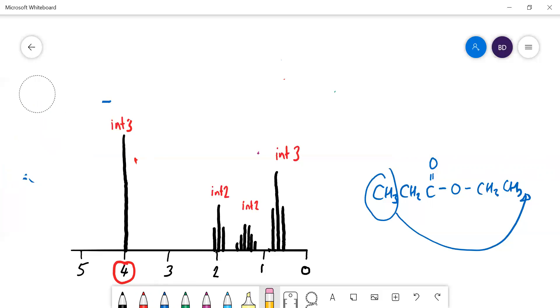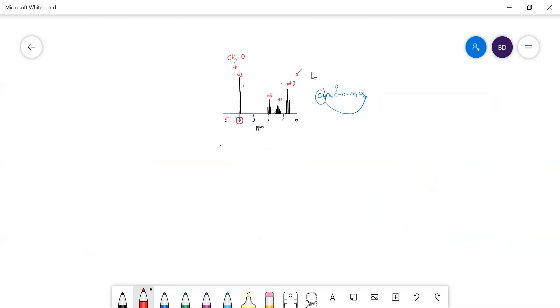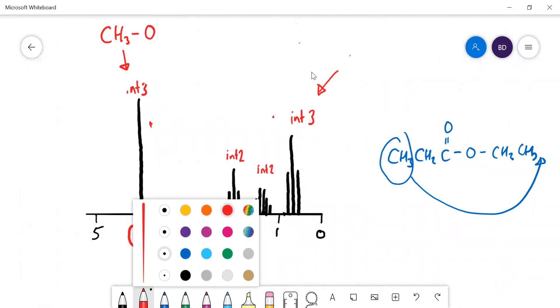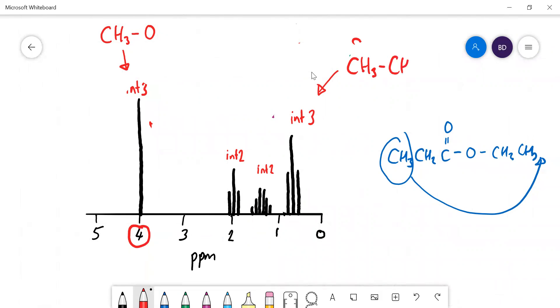So we have got CH3O, that's what that one is. Let's have a think about this one here. It's a CH3 because it's got an integrated value of three, and it's got a splitting, it's a triplet. So that is probably a CH3 next door to a CH2. Having these two hydrogens here would split this into a triplet. Let's see if we can locate where that is then.